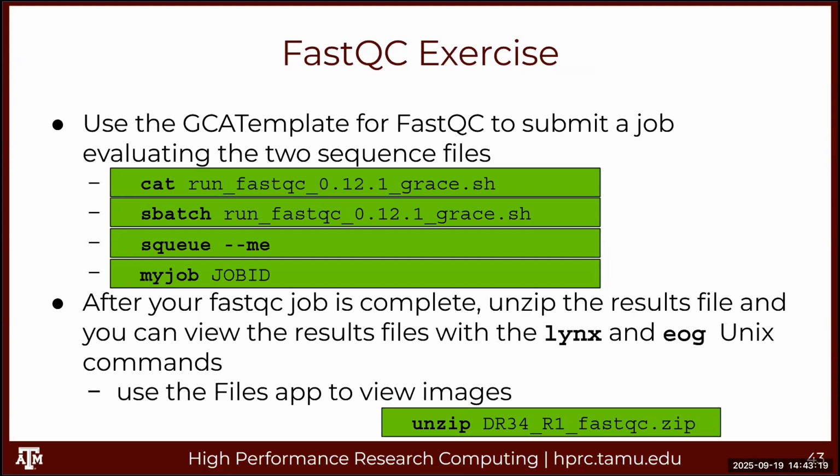Oh, I'm sorry. Since we're working on Grace, you need to do space. Now do sbatch, space, and use tab, and enter. See, this one's called launch. Now it's running. It's going to take just a minute. I didn't realize you don't have the unzip command installed.